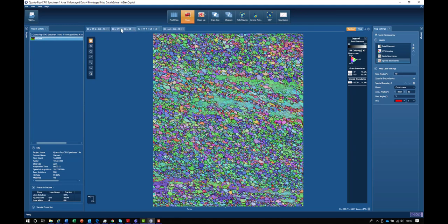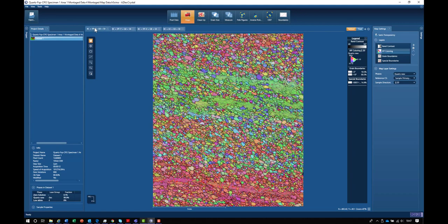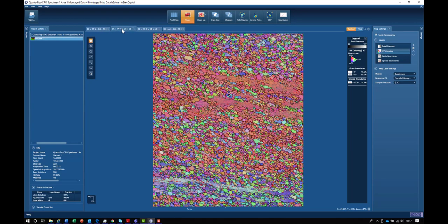We can do the same for the Y direction and for the Z direction. If we go back to the Y direction, you can see that large areas in the map are colored red, which we can interpret as the C axis of the quartz crystals predominantly lining up with the Y axis of the map.